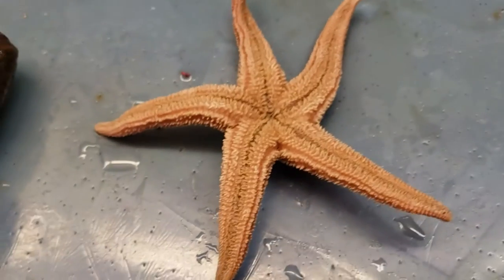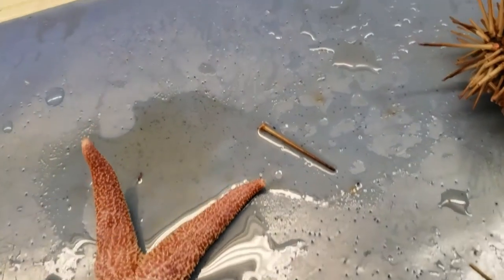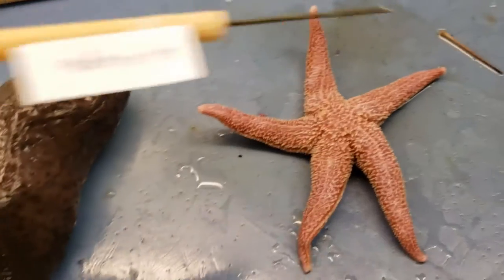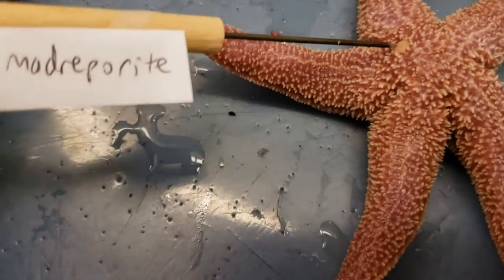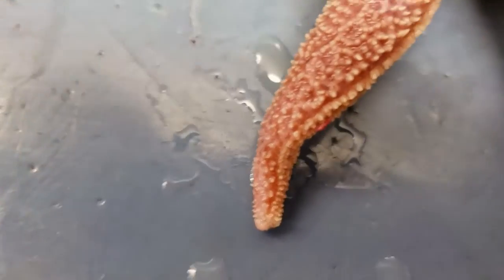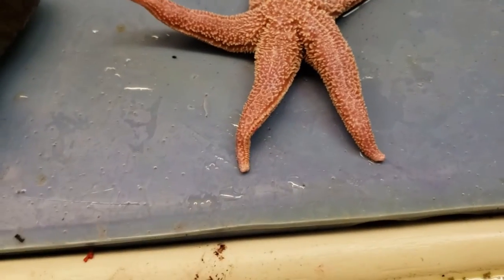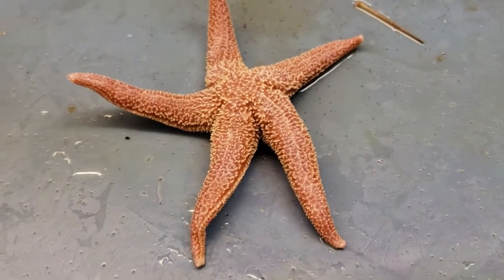What else can we point out? We can go up high and point out the madreporite, which is this structure here. It plays a role in the water vascular system of echinoderms, so it's an important structure for that. It's also near the anus. That's it for the external part. We'll look at the internal and external for the sea cucumber and the sea urchin when we're actually doing that side. See you on the flip.